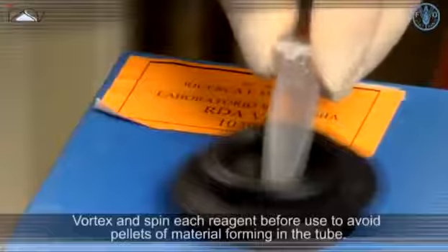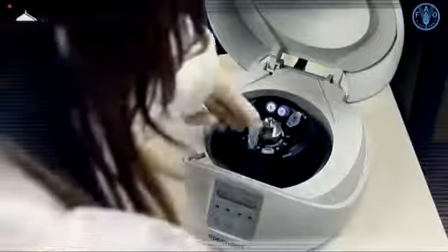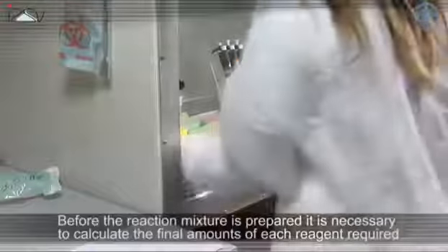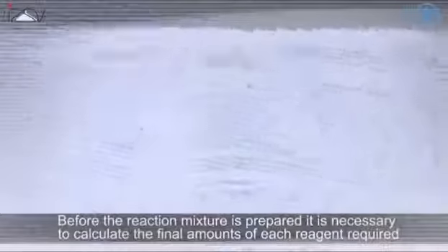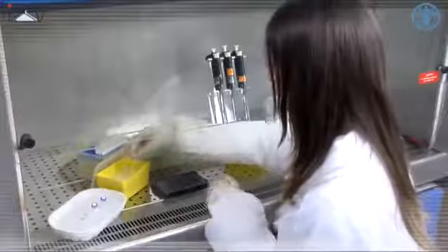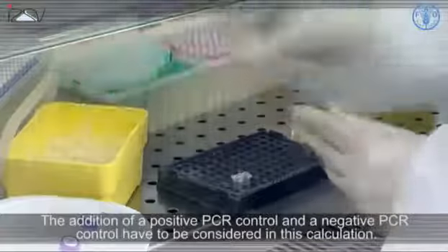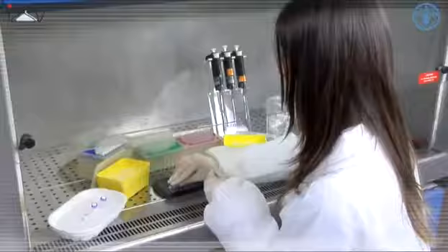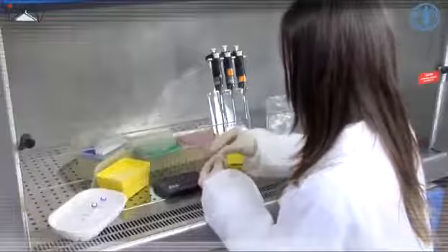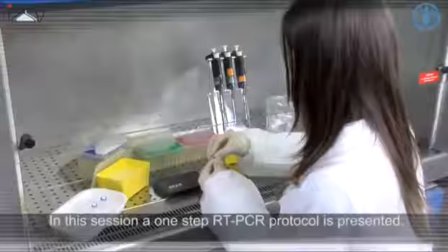Vortex and spin each reagent before use to avoid pellets of material forming in the tube. Before the reaction mixture is prepared, it is necessary to calculate the final amounts of each reagent required for the number of samples under examination. The addition of a positive PCR control and a negative PCR control have to be considered in this calculation. In this session, a one-step RT-PCR protocol is presented.